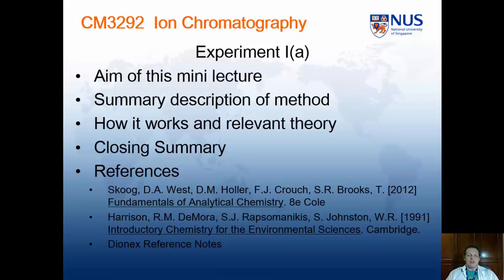I need to talk a moment about references. Skoog et al., a good solid analytical textbook. It has many of the tools in it. It doesn't particularly cover ion chromatography very well, but nonetheless it's here simply because of all the other things it covers. The Harrison reference does a competent coverage of ion chromatography and certainly covers what we're going to be talking about in this lecture.